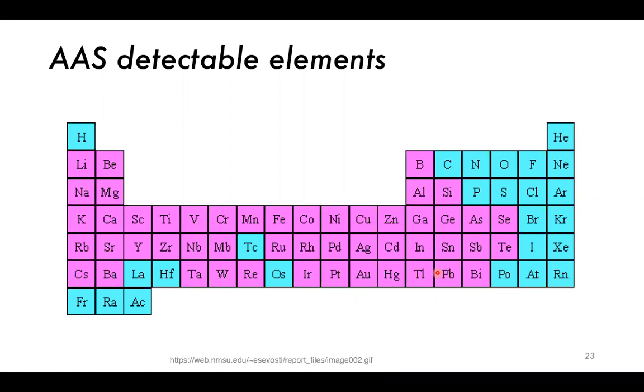Today, we've talked about the spectrum, especially the emission spectrum, how different types of broadening can really affect the measurement, and how temperature changes are bigger problems for emission spectroscopy than absorption spectroscopy. That's the Boltzmann distribution, pretty heavy on physics, but really it's the cause of that problem in emission spectroscopy. So it is something that you really need to be aware of.